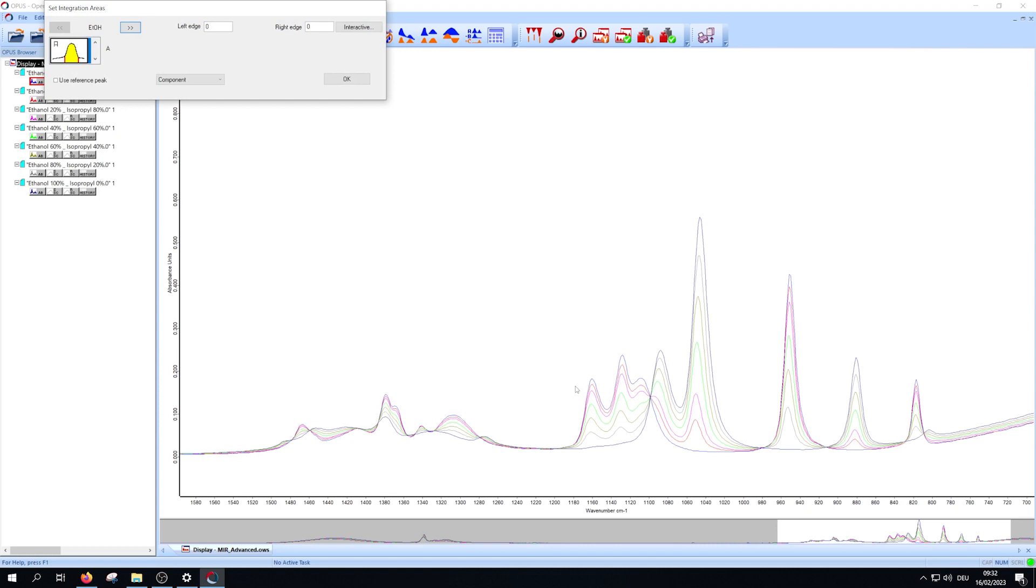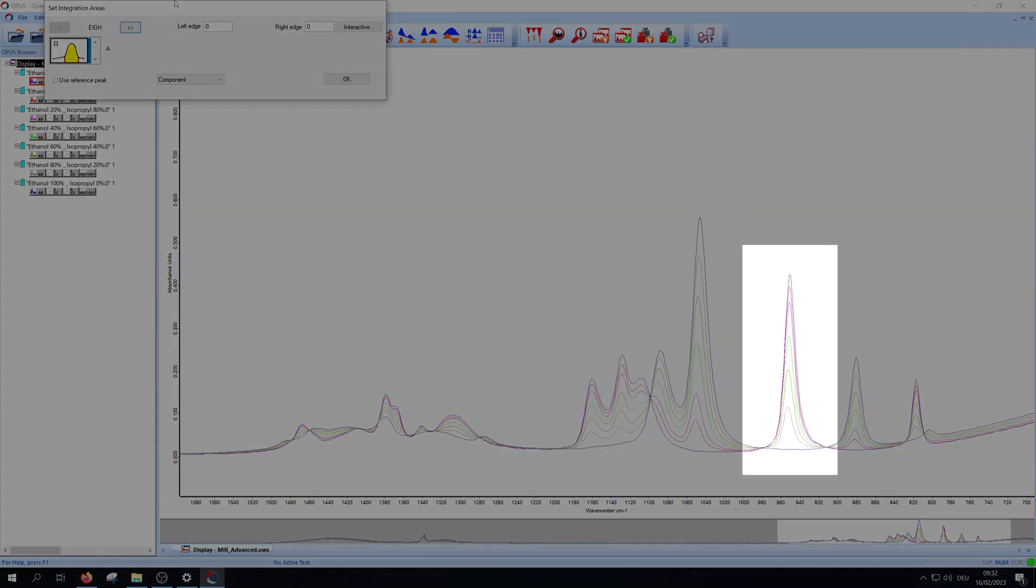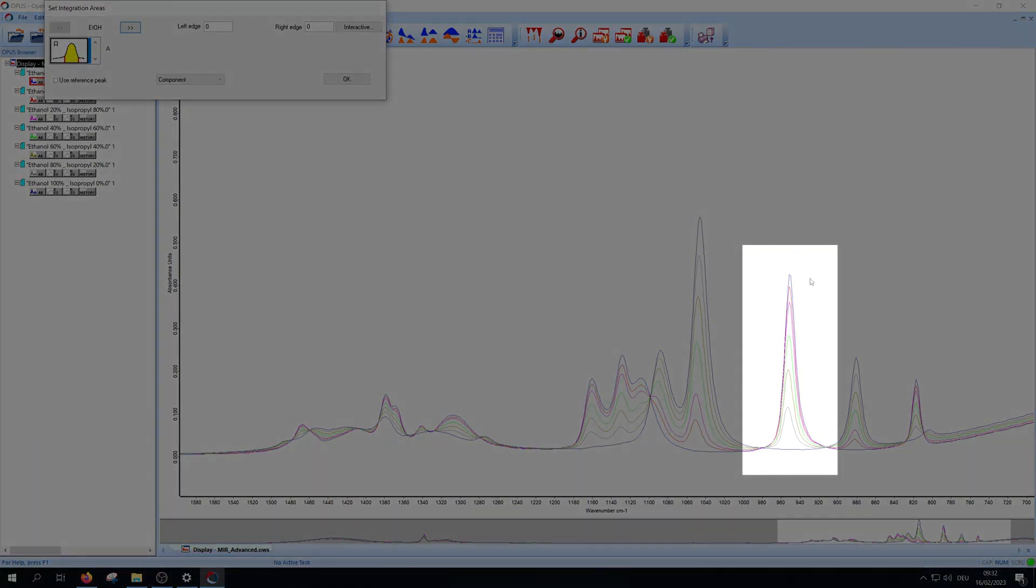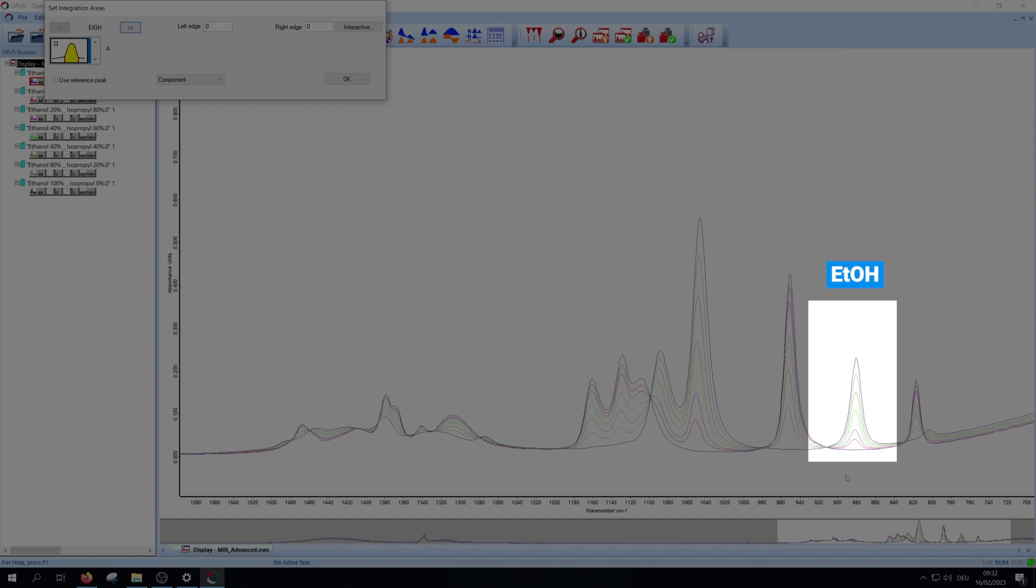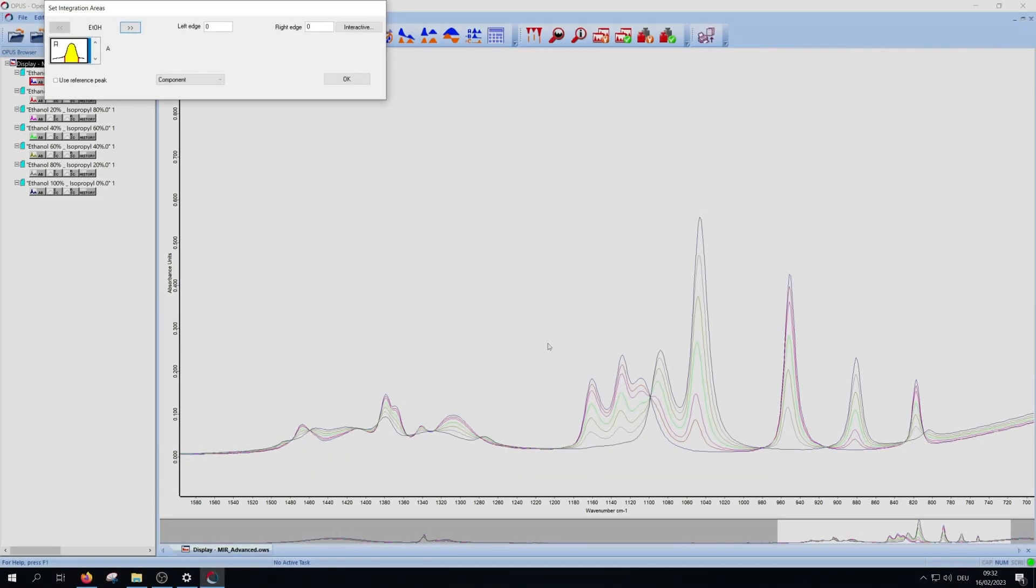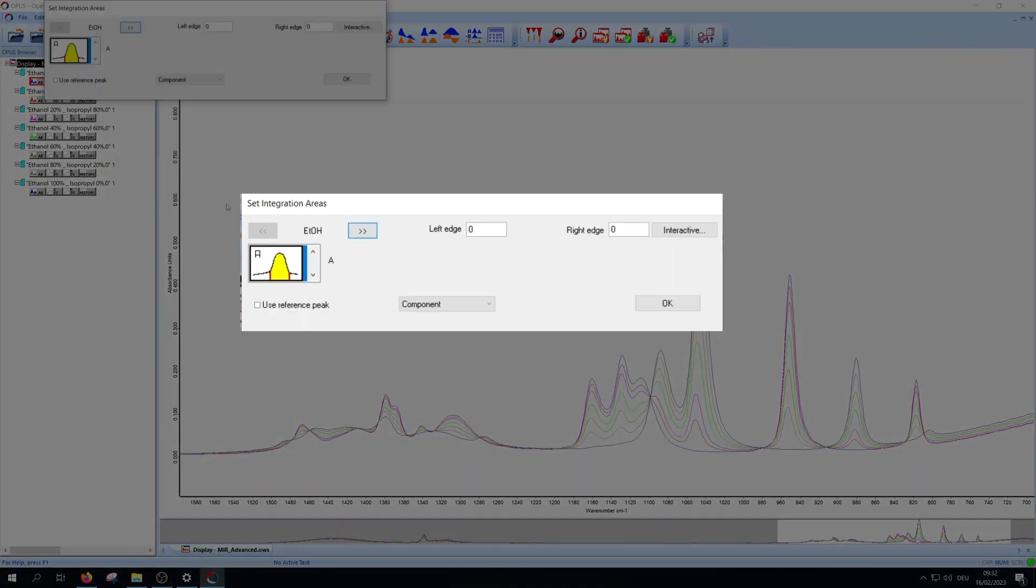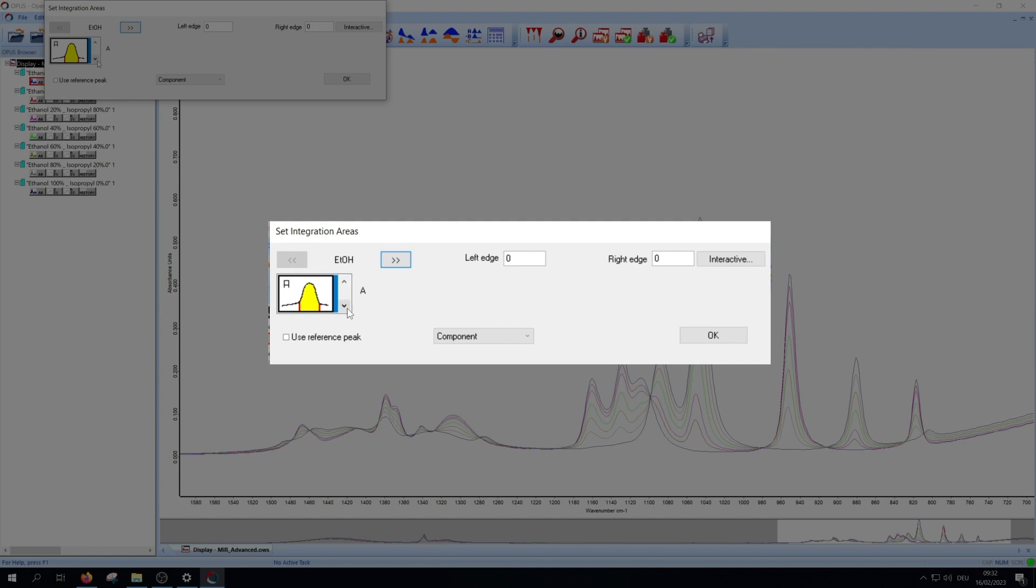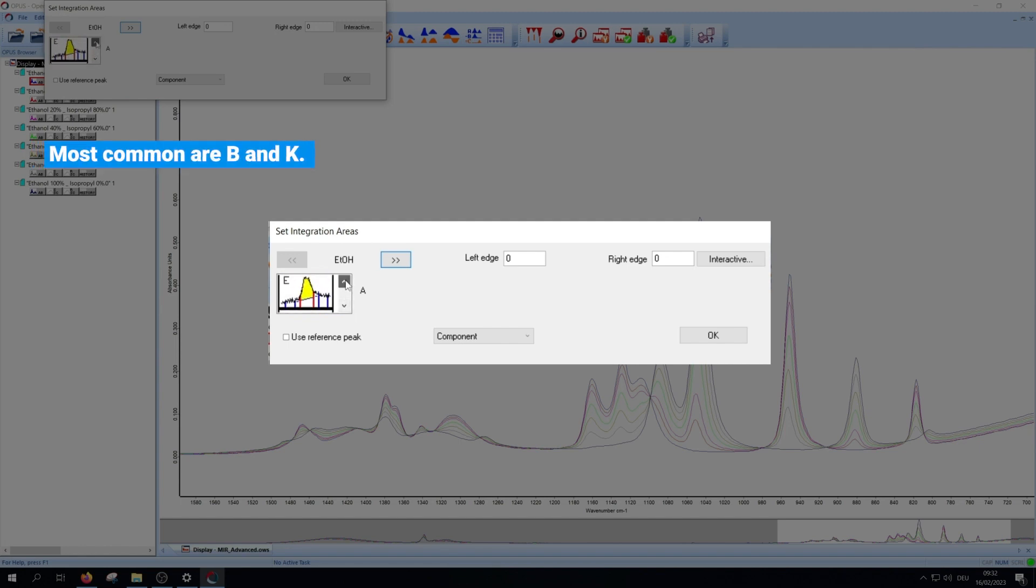For each component you need to select a range in which there is a clear and unique peak for that component. In our example this is a peak for isopropanol and this is one for ethanol. First we have to choose between 19 integration methods. The most common are B and K.